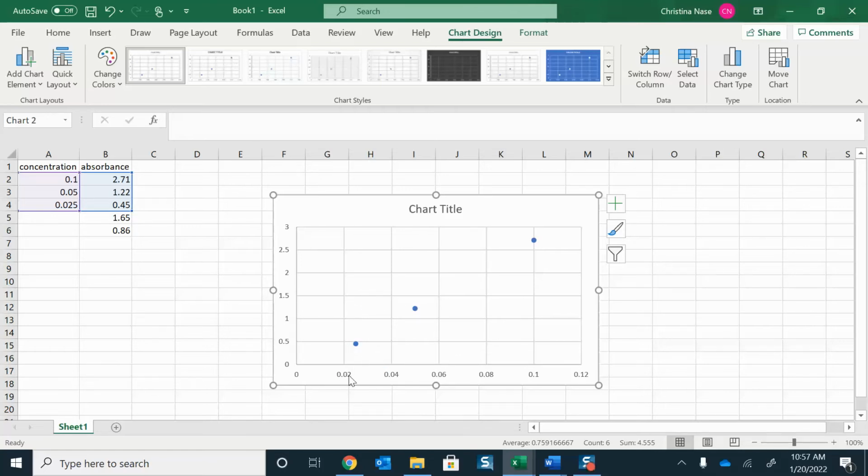My absorbance is right. If you're getting on the bottom axis here 1, 2, 3, and it's just plotting those points, it's not reading this data. It's just saying that this is 0.1, this is 0.2, this is 0.3. Make sure that you don't have any concentration units in here, like an M or any other weird things. It should just be the numbers.